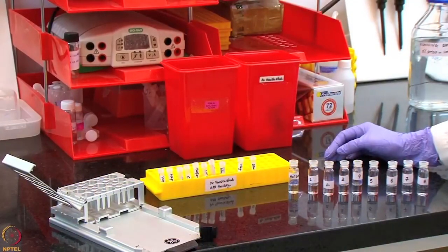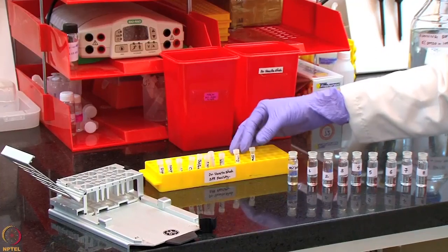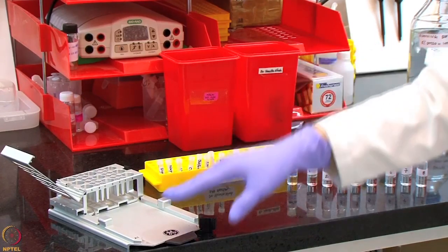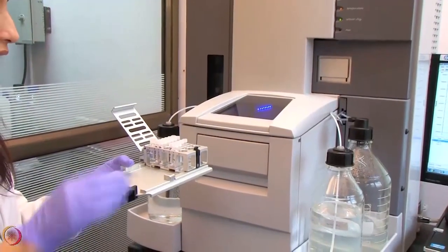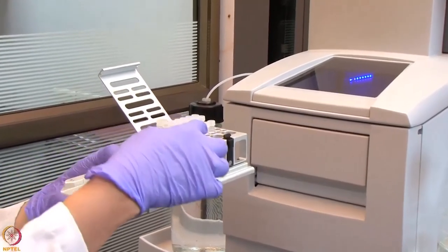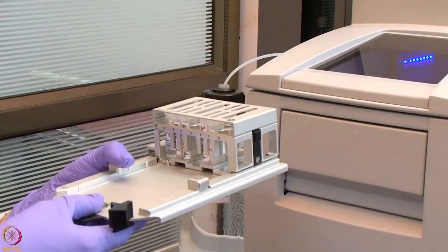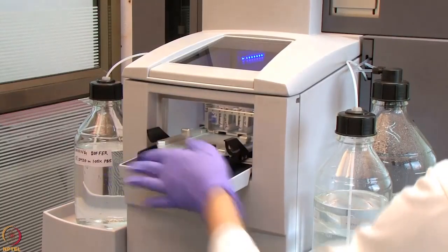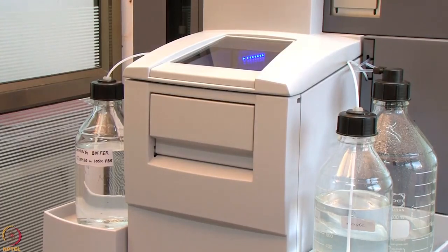We will now proceed to insert these tubes, including the samples at 30 micromolar concentration, the negative control, the startup, 50% DMSO as wash solution, and the solvent correction solution into the appropriate rack and then into the system to perform the protein small molecule screening assay. We have now placed all our tubes inside the rack, including the wash solution, the samples, the solvent correction solutions, the startup solution, and the negative control. We are placing this rack inside the system to start with our screening assay. We will now start with our run as demonstrated in the earlier lectures.